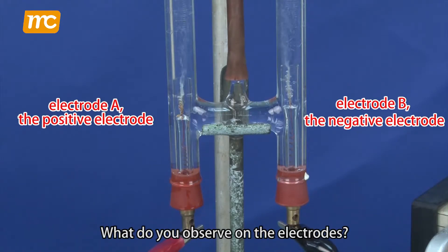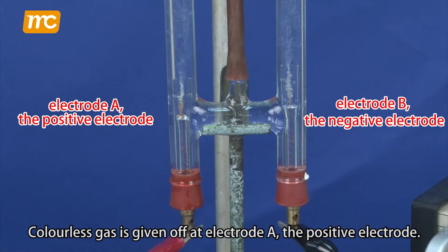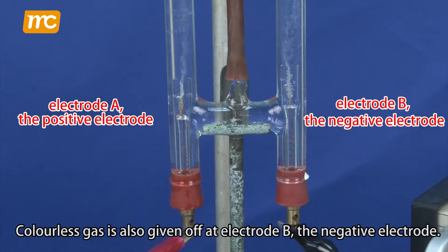What do you observe on the electrodes? Colorless gas is given off at electrode A, the positive electrode. Colorless gas is also given off at electrode B, the negative electrode.